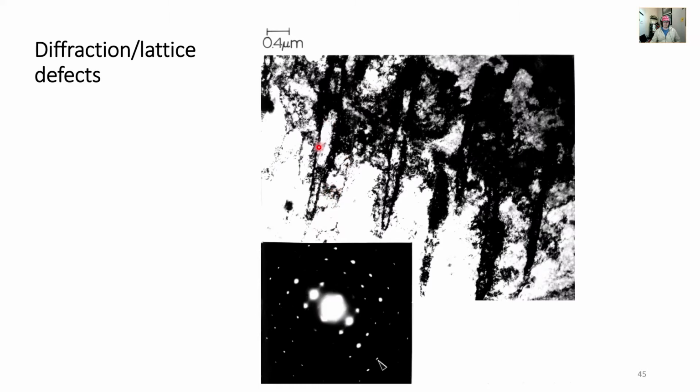And dislocations, of course, are an extra or missing row of atoms depending on your point of view. We have them all grouping together to form this microband structure, and we see it reflected on the diffraction pattern here. So this is an example of diffraction contrast. I think now would be a good time to go into an explanation of electron diffraction, so we'll go into how electron diffraction occurs.